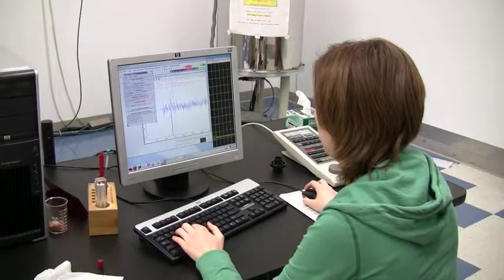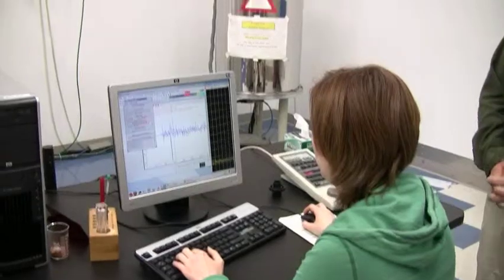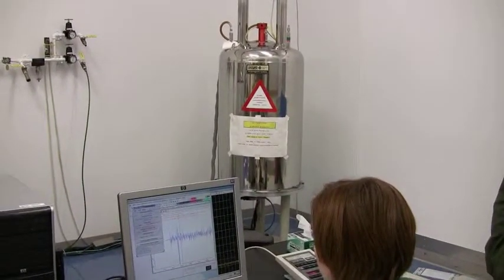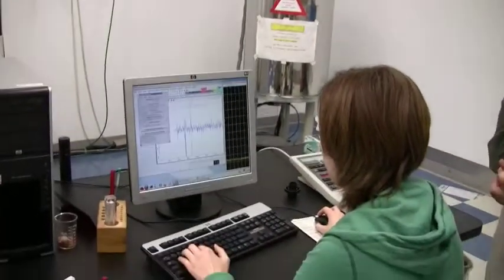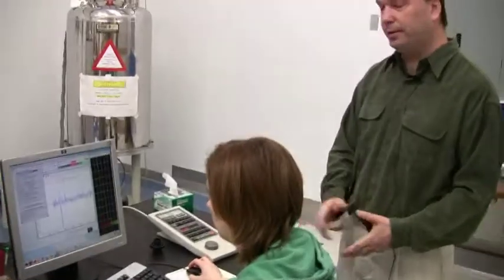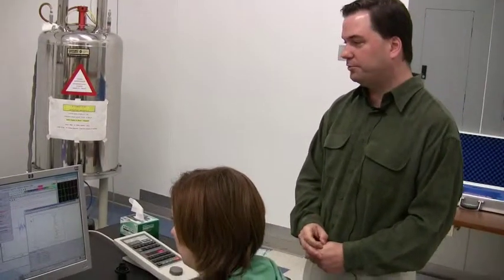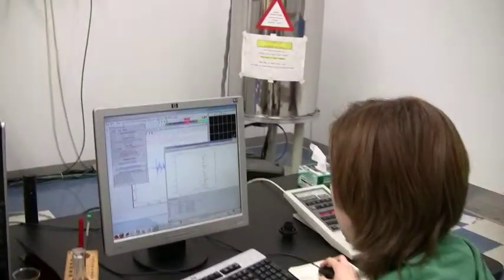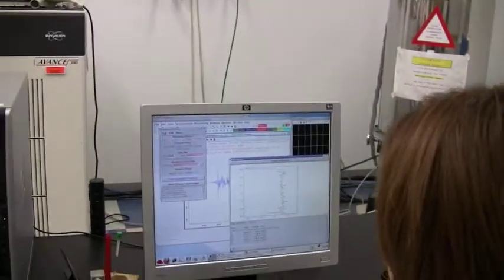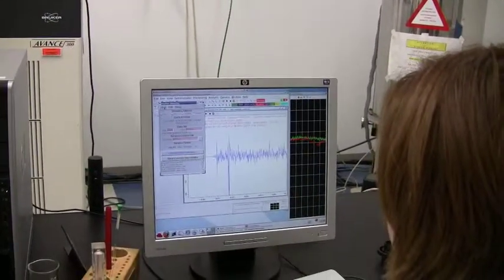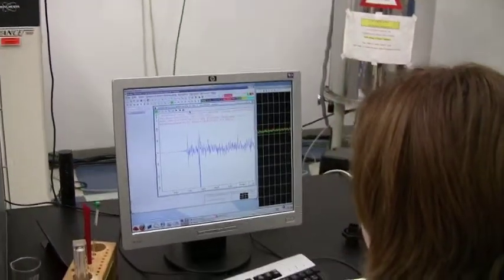We have a student that's currently acquiring a proton spectrum. What they're working on right now is called a process of shimming, and what that process involves is every time we put a sample in the magnetic field, we disrupt the homogeneity of the magnetic field, and so we have to re-optimize the homogeneity of the magnetic field.